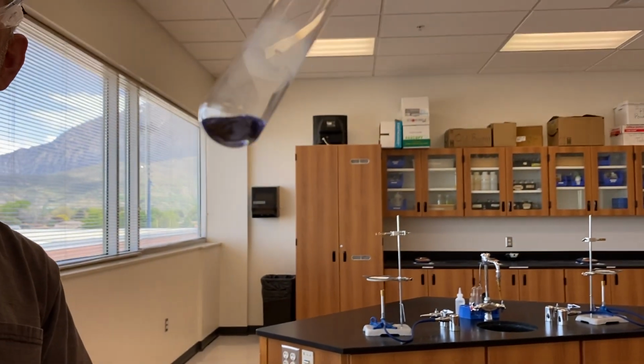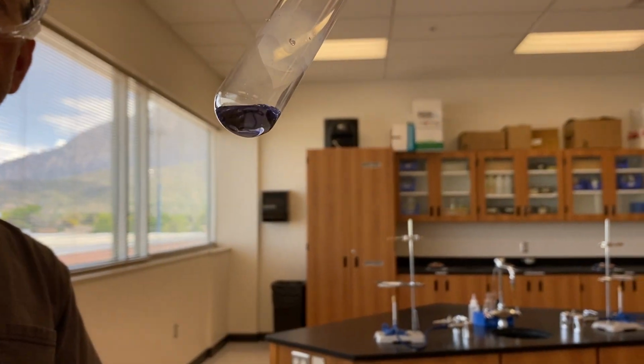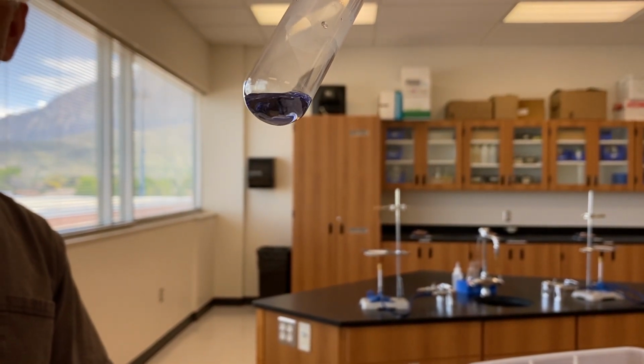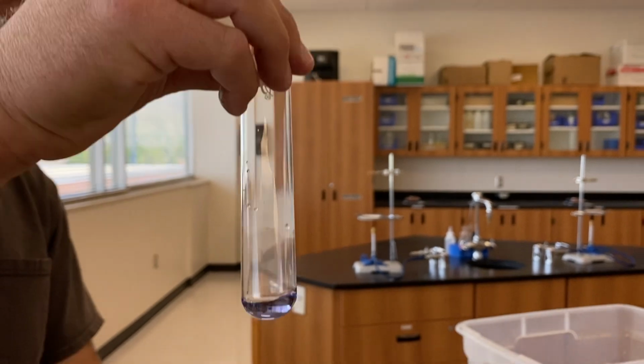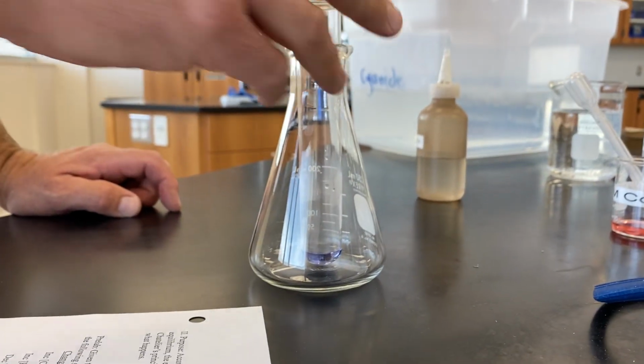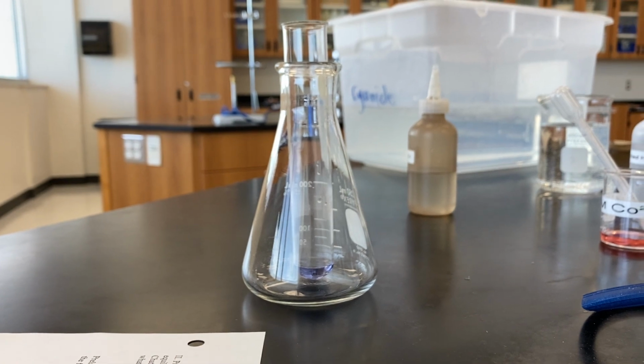Does that come through okay? Let me focus it in. Okay, you can see that that is that darker, kind of purplish blue there. Blue color. Yeah. All right. So that takes us through the end of step 4, where we achieve that blue color. And now we're ready for step 5.